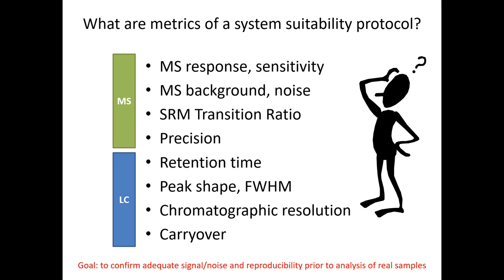I personally have accidentally replaced my empty argon cylinder that I used for collision gas with helium because I was tired. I'm always tired though, so it doesn't really count. They're the same color, and you think that I would have seen this label that's on this like 5.5 foot cylinder, because I had to roll it down the hallway, so it must have passed by my eyes like 50 times before I installed it, and it was helium.